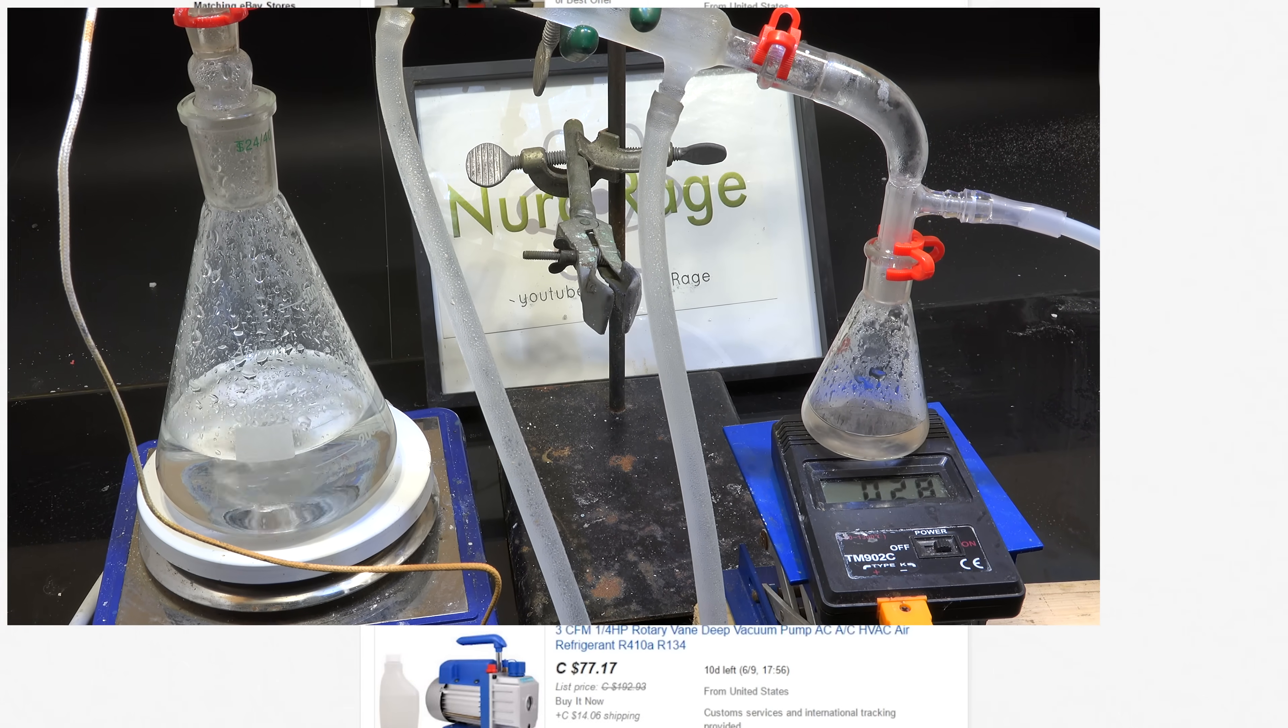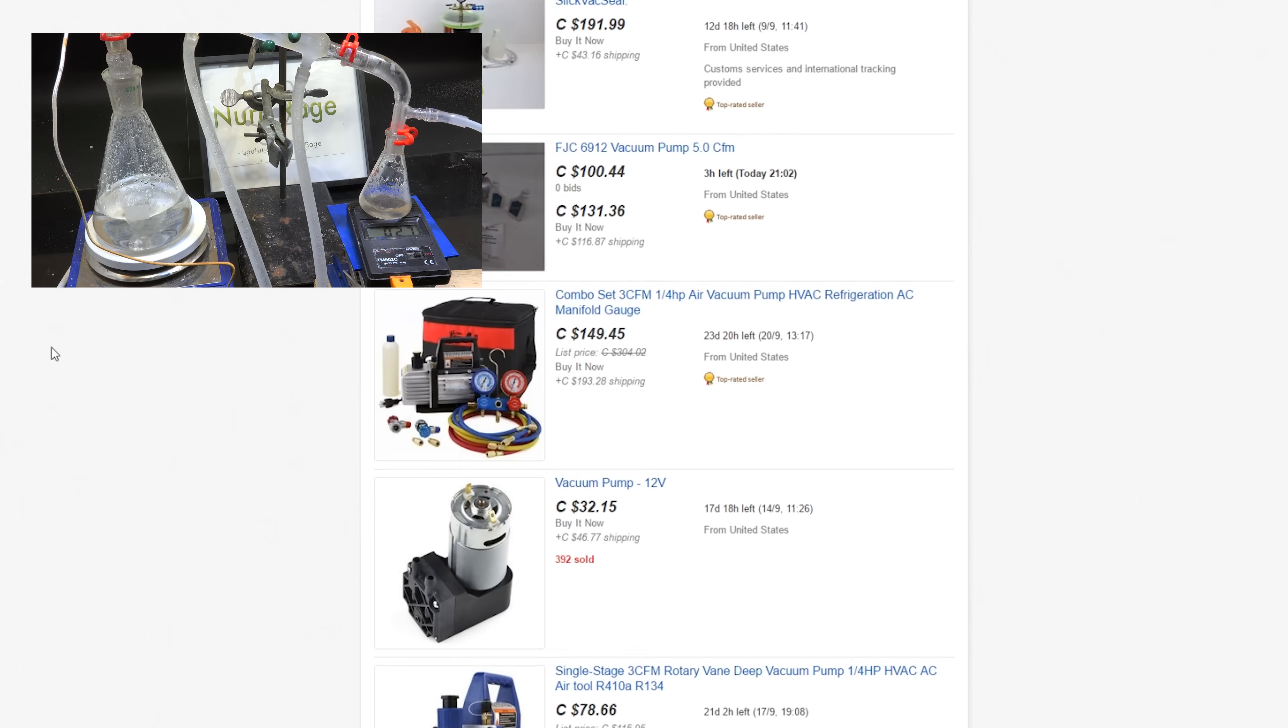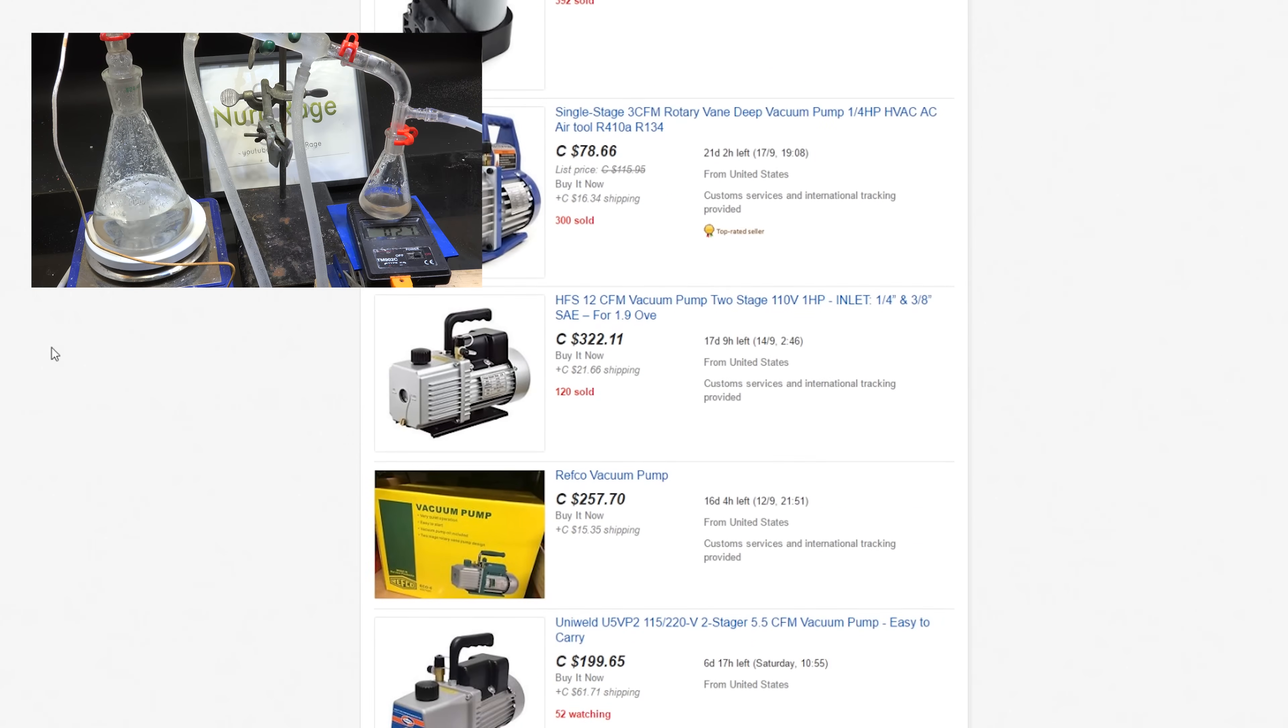Now if you go online and look for vacuum pumps you'll find thousands of better vacuum pumps that can easily reach submillibar pressures for very reasonable prices. Most of them are of the rotary vane type.